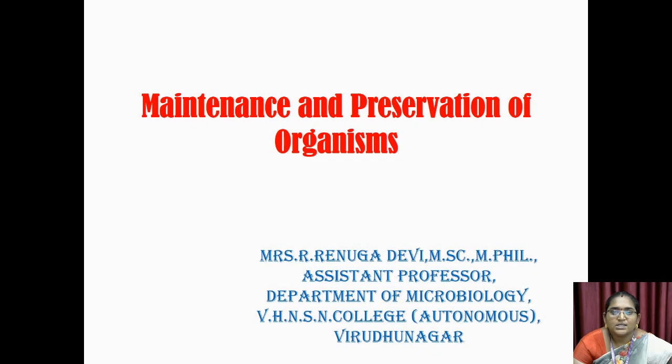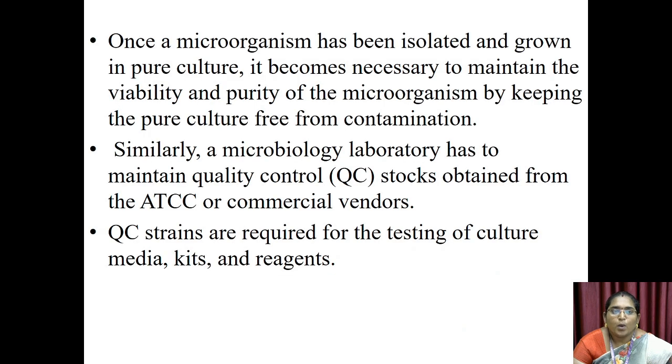The topic is maintenance and preservation of microorganisms. Once a microorganism has been isolated and grown in pure culture, it becomes necessary to maintain the viability and purity of the microorganism by keeping the pure culture free from contamination.